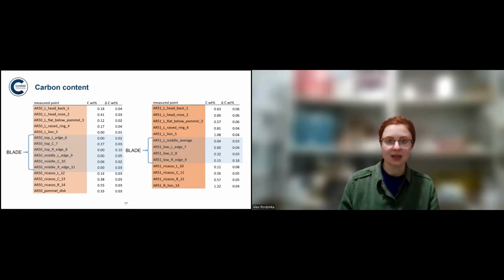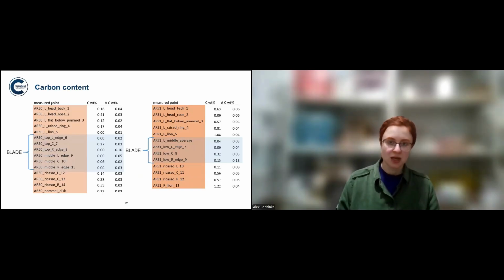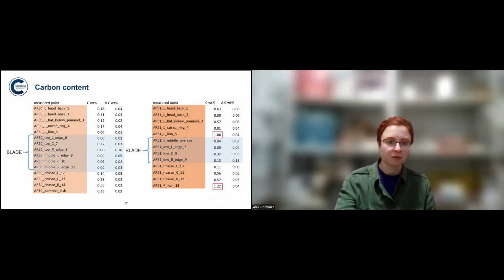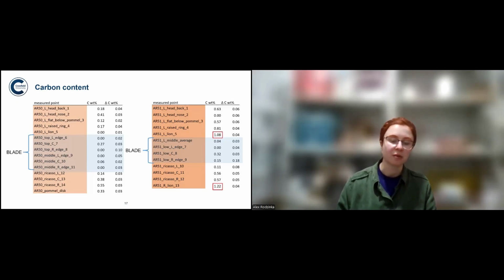And to do that, that's a kind of case where you'd have to measure different points along the blade and compare them with points on the hilt to see if the points along the blade have higher carbon content. Because if you try to do it intentionally, that's where you'd want the sword to be reinforced. But you can see here, from the information we've gathered, that the highest levels are actually in the hilt, and the blades aren't higher in carbon at all.